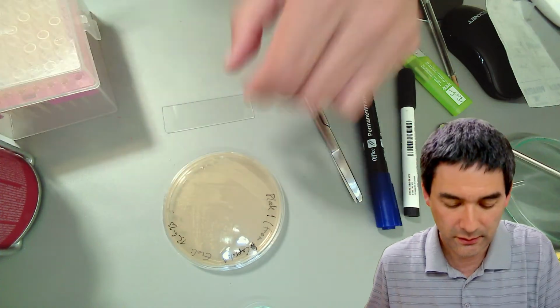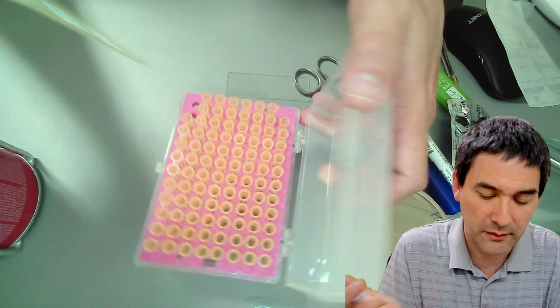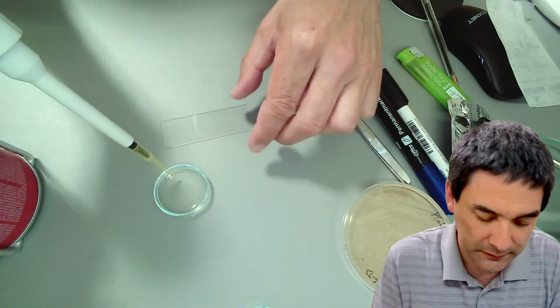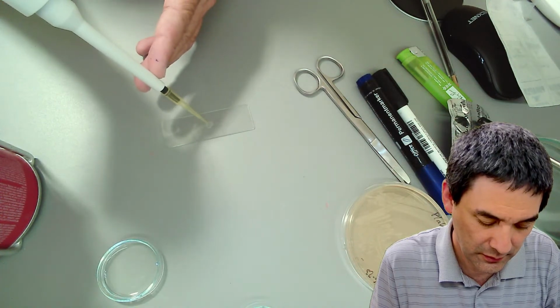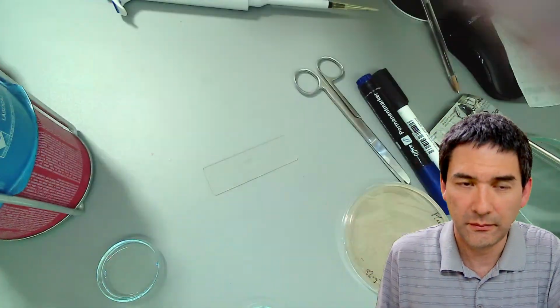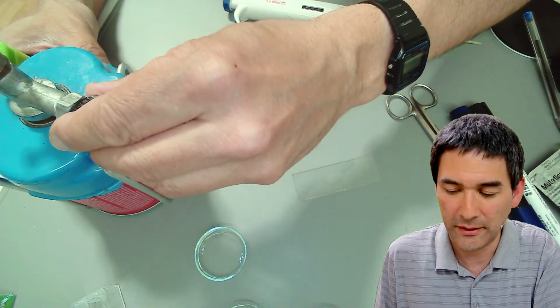Okay, in case you have not seen this either, the microliter pipette. You go in here, and here we go. And now I'm able to take up some water with this. I've prepared some water over here. Okay, and here is a drop of water. I'm going to, again, you just have to trust me on this, that there's a fire burning here. Okay, and let me turn it down a little bit.